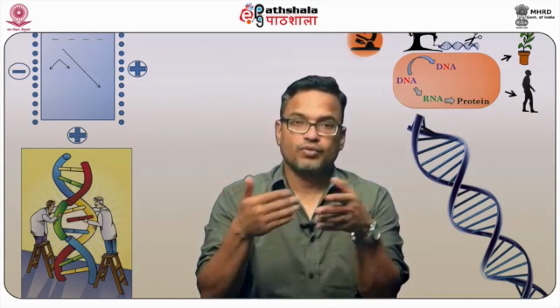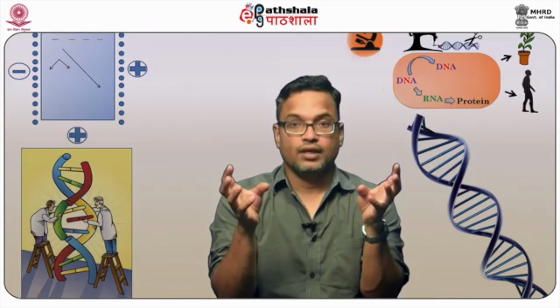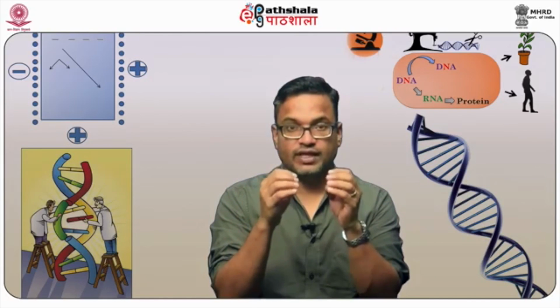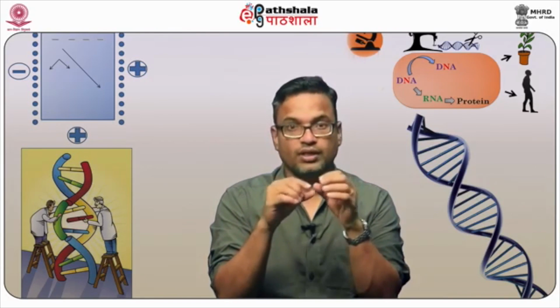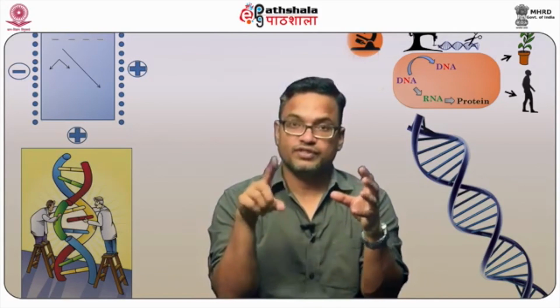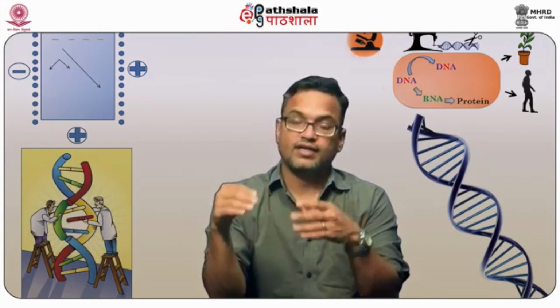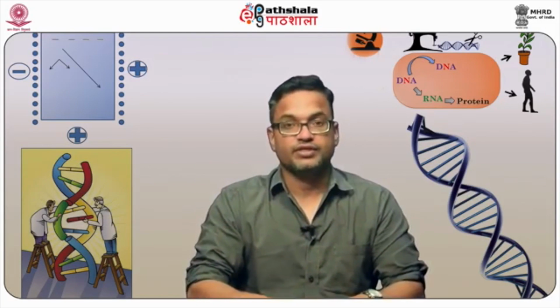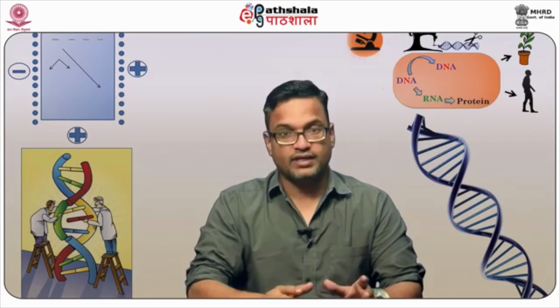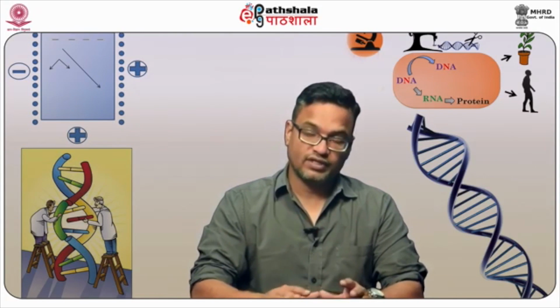And on the other end, SNOM is also based upon the interaction of the evanescent wave that is generated once light of a specific wavelength is passed through an aperture smaller than the wavelength. It generates an evanescent wave which resonates in that area and also gives information about the sample it is interacting with, and that information is used to generate a high resolution image. So these two techniques are very different from the light and fluorescence based imaging microscopy which we discussed earlier, but give another dimension to the applications available with the range of microscopy we have available.